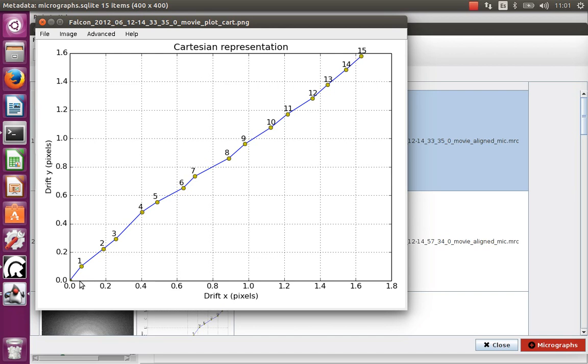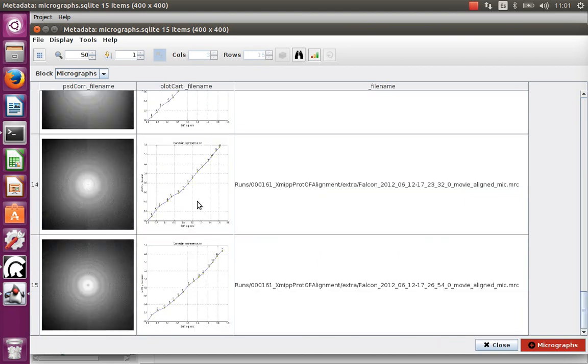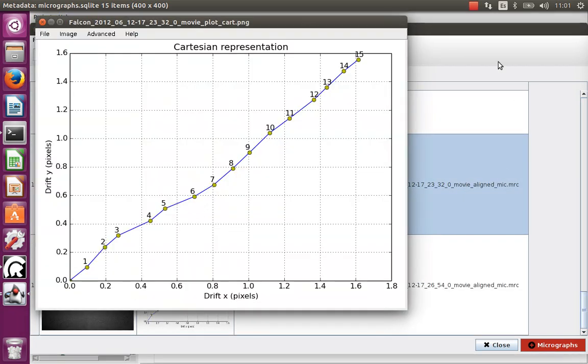So that means that on average every pixel from the first frame to the second moves about 0.1, and we don't care about the direction. That is why it looks like an ever growing curve, because we are adding absolute values. Okay, so we may look for some other movie just to see if the little movement is still confirmed.